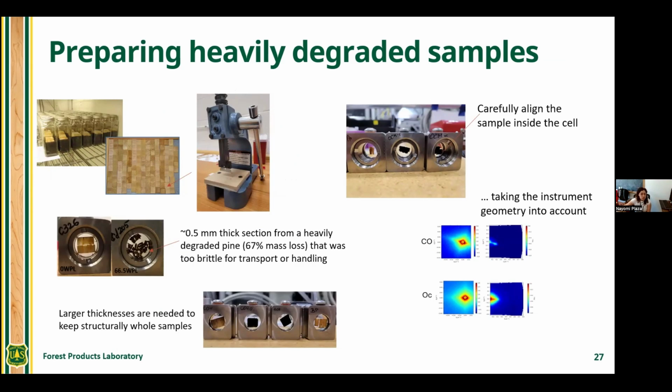So what we do is that since we know the swelling is not primarily plane dependent, we go ahead and reveal radial longitudinal surfaces from one of these blocks using the guillotine. Typically, we have soaked them a bit so that it's easier to cut a small surface. And then we air dry those surfaces ahead of time to make sure there's no curling. Sometimes we have had to use glass slides to make sure that they don't curl, though samples are a little bit thicker than 0.5 millimeter, so that's not often a concern.